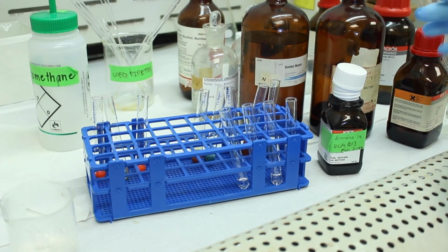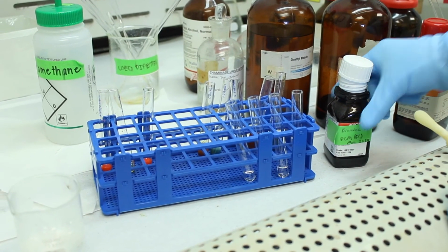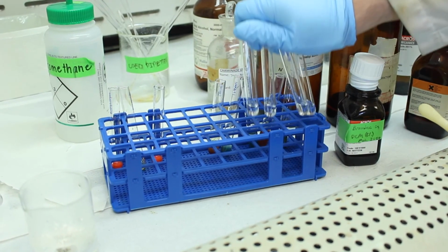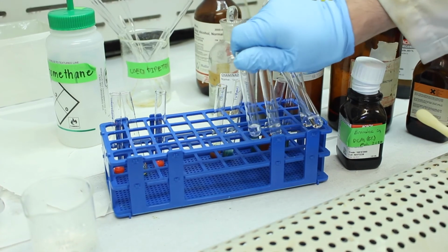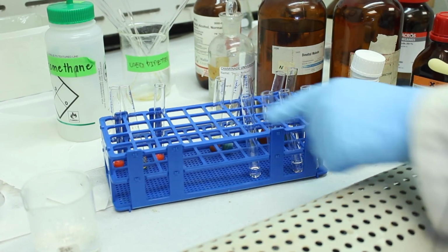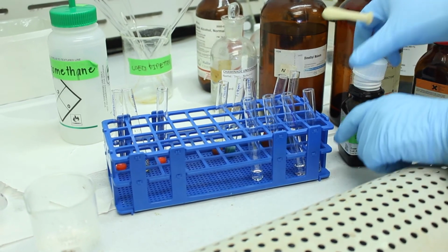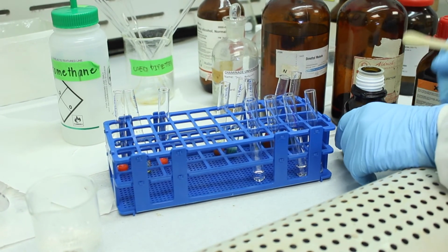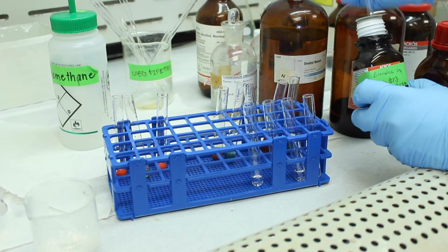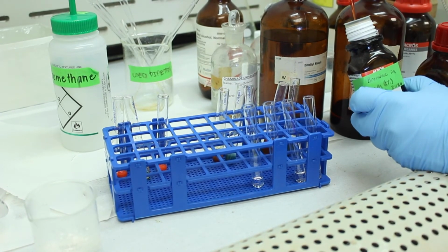The final test we're going to do is our bromine test. So we have 4 test tubes. One is going to be our control, and they all contain DCM, the solvent. The reason DCM is used as a solvent is because it's inert, does not react with bromine. Bromine is very reactive. And here's the bromine reagent. It's not pure bromine, it's fuming a little bit, but it is bromine dissolved in dichloromethane. As you can see, it's a nice red color.